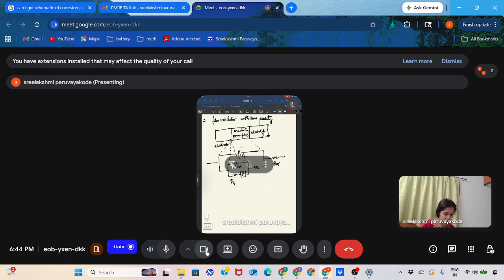And within that, you'll also have another R. So this is how the plot will come. This has some porosity. Some porosity means it is allowing some electrolyte to pass through. So this means some current is passing.